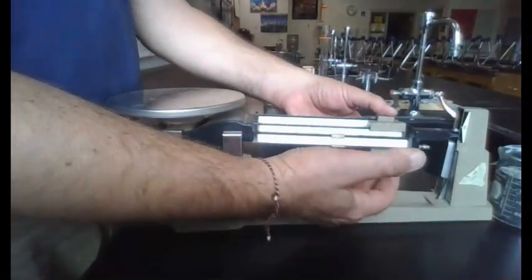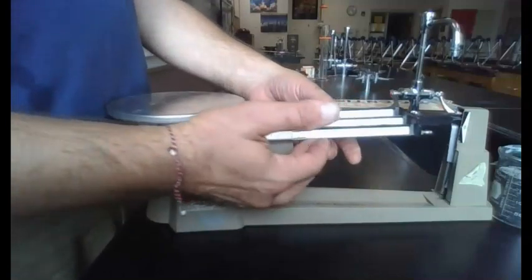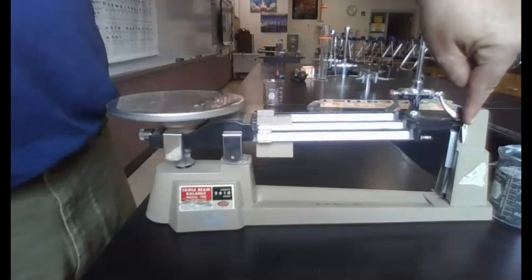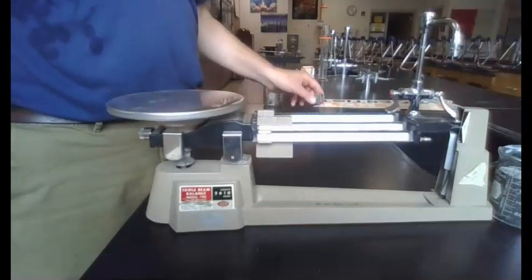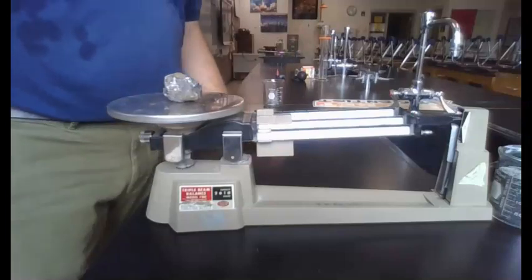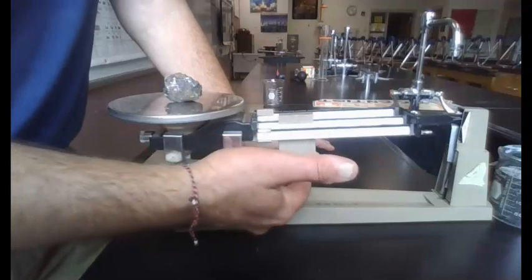So how do we use it? First thing you're going to do is put all the weights to 0. And the scale should end up at the 0 point here. Then you take your sample, here's our galena again, and we put it there. We start with the largest weight.